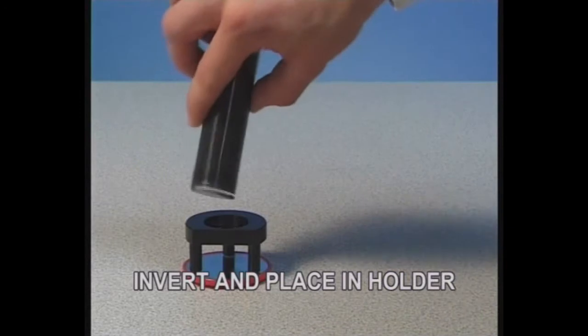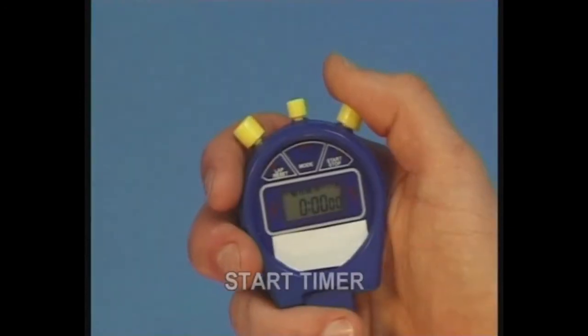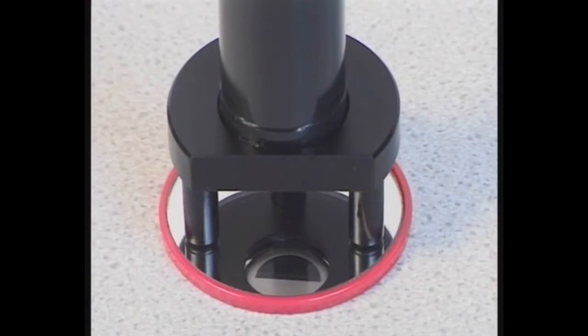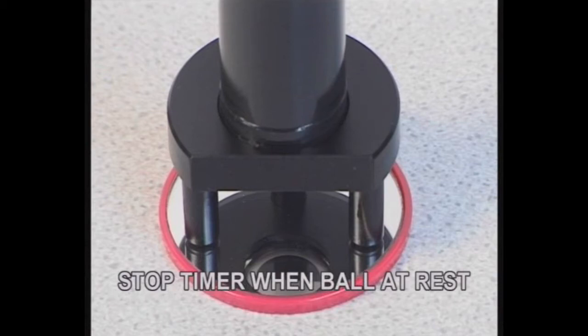Invert the visco tube, place in the holder and start the timer. By observing the visco tube in the mirror, stop the timer when the ball comes to rest. Record the time.